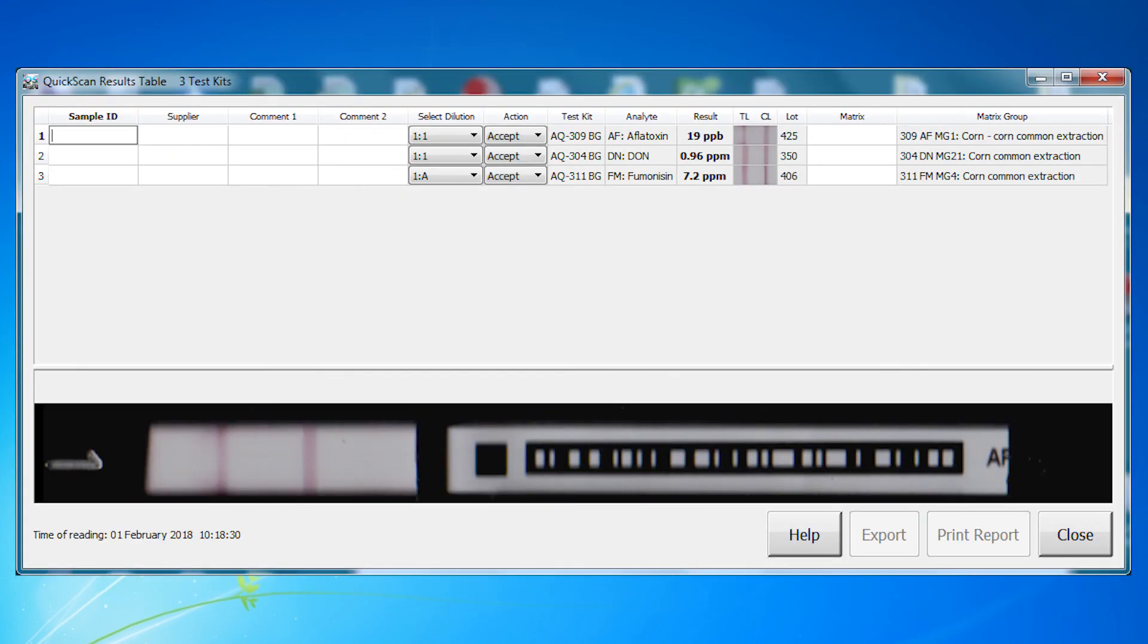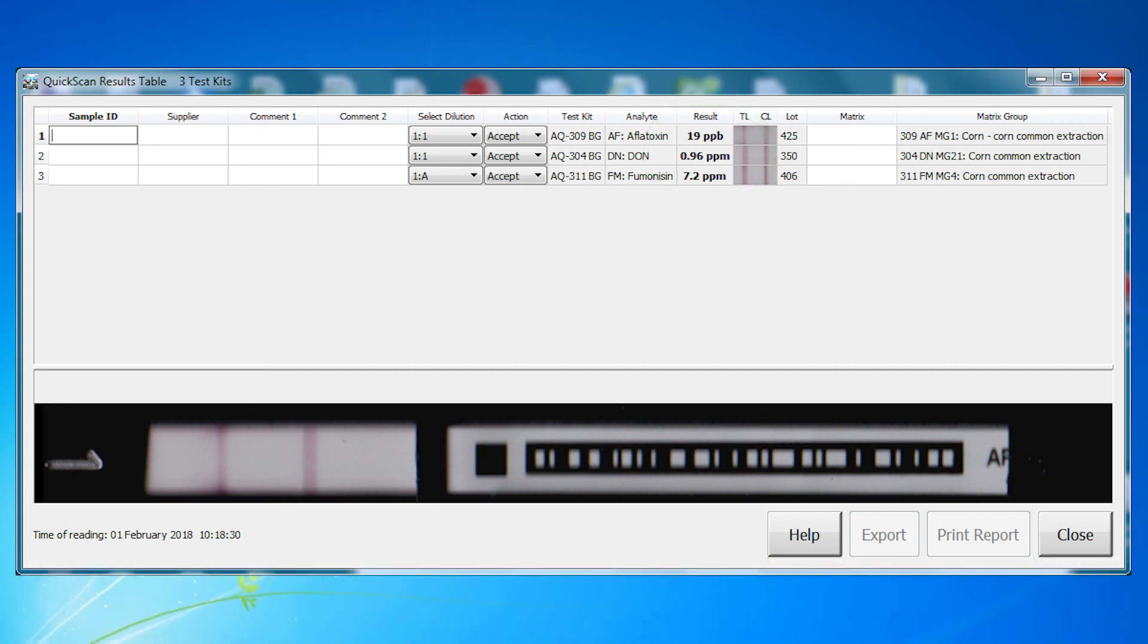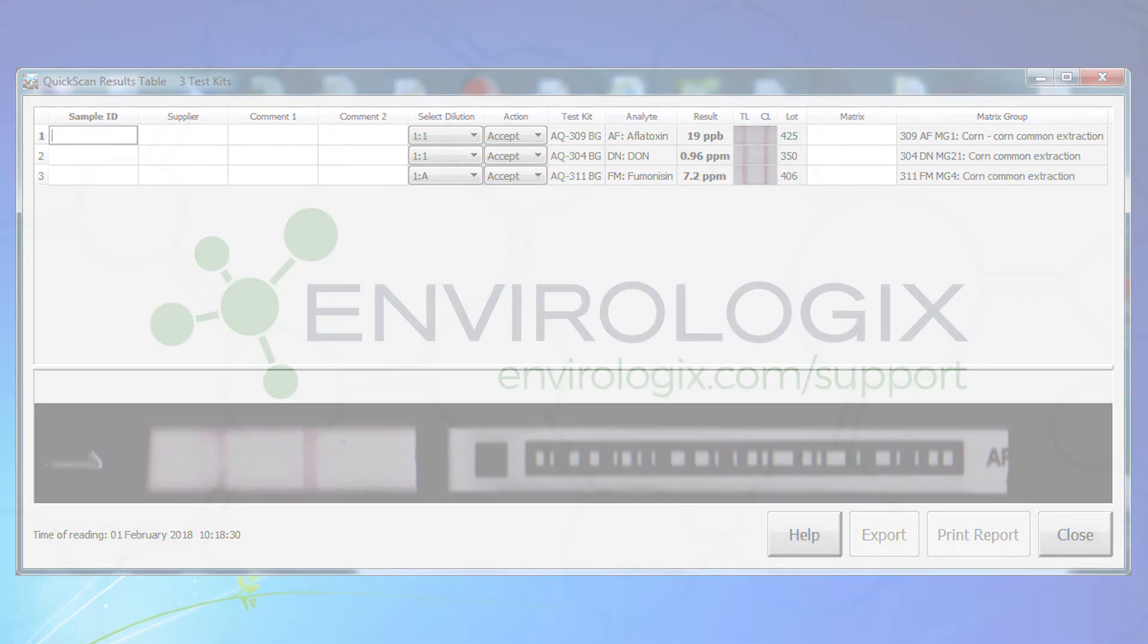Also, ensure that the dilution tab for Fumonisin is selected as 1A. If you obtain results outside the base range, further testing may be possible. Please refer to the common extraction product insert for additional testing options.